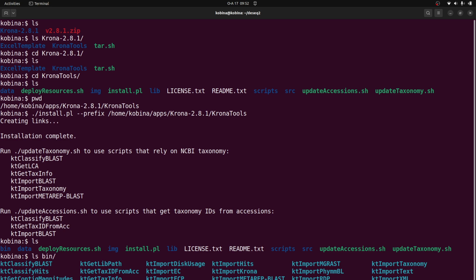visualize. Another thing we have to do is allow permission. We have to enable permission, read and write, and then execution, in some of these directories. I'll show you very soon. So let's proceed. Okay, so now we can proceed.